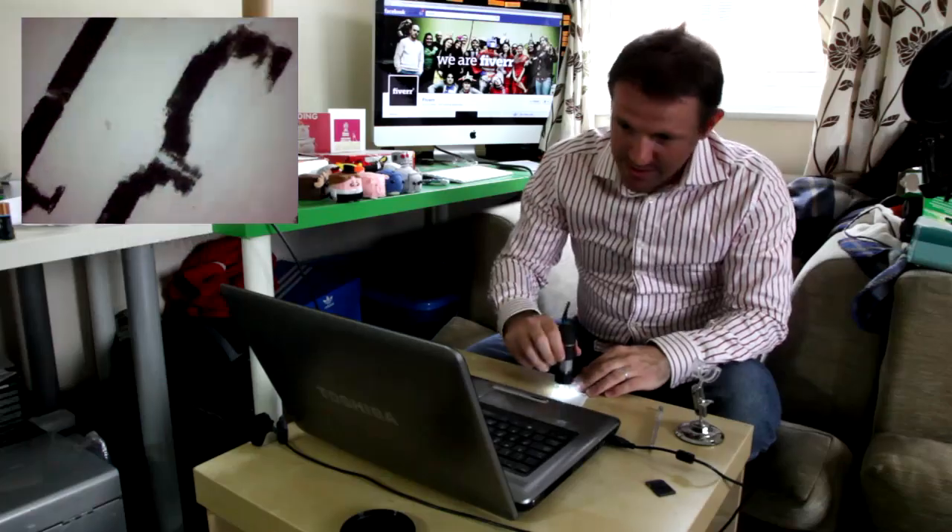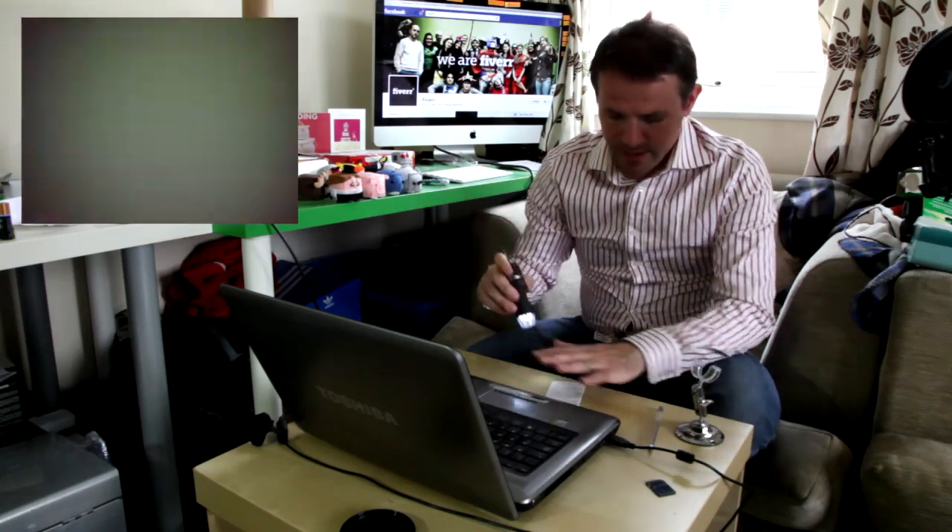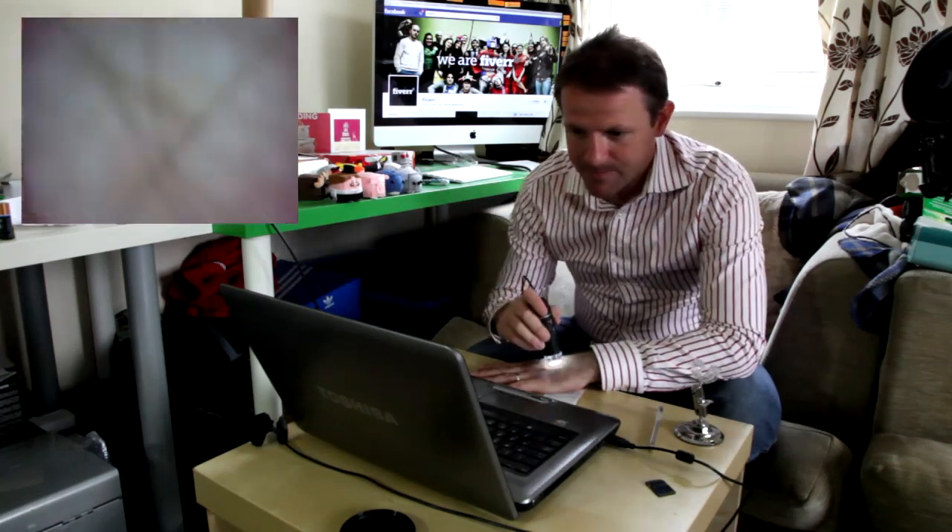It's got some lights, some LEDs in it. I'll place it on this receipt here — it says 31 pounds 55 on the receipt. You can see the pound sign there. You can see how much it zooms in, which is fantastic. It's tiny, it's really cool.